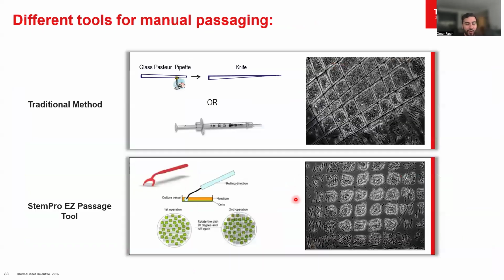Okay. So we talked slightly about how to make those cuts manually, and this was maybe a little bit more of a traditional method that honestly I still like and I employ. Catherine, Kita, I don't know if you guys still do this in the lab as well in terms of manual scoring, but I find that I have really good control with it. But there's other alternative methods, and some of them are actually starting to become really, really nice, right?